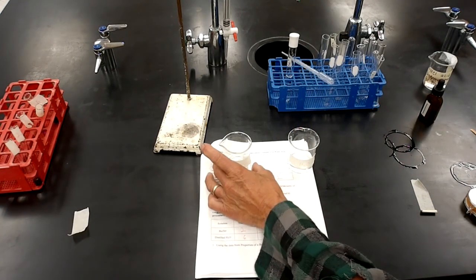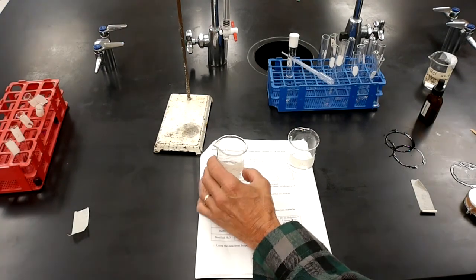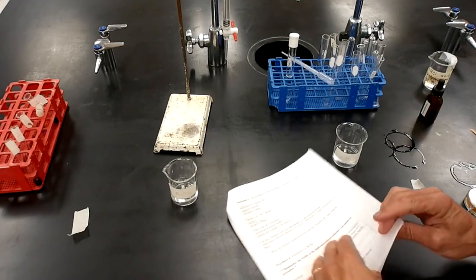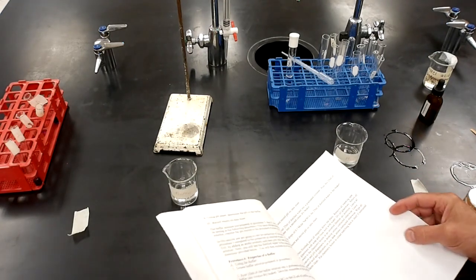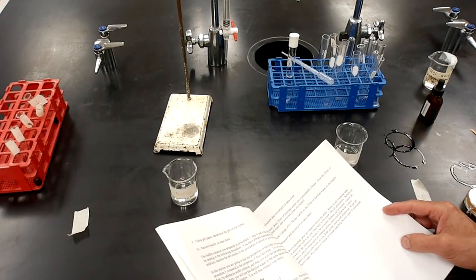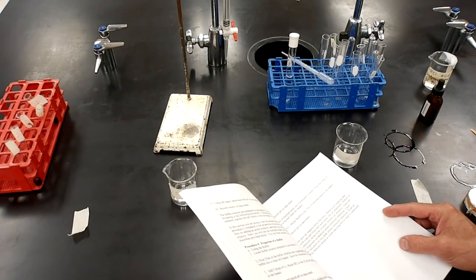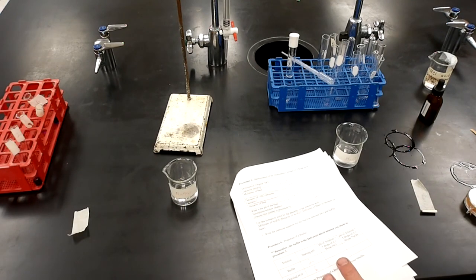All right. So now I've got 25 milliliters of my buffer solution, that half neutralized acid, in this beaker, 25 milliliters of distilled water in this one. Now, what my instructions are going to have me do is, to the buffer solution, add 5 drops of hydrochloric acid.